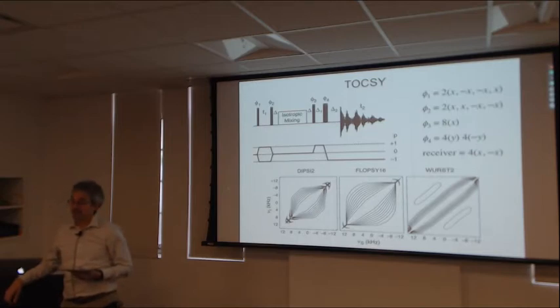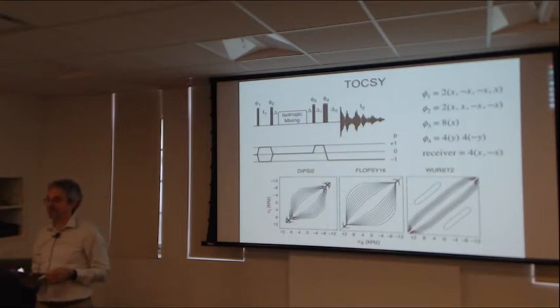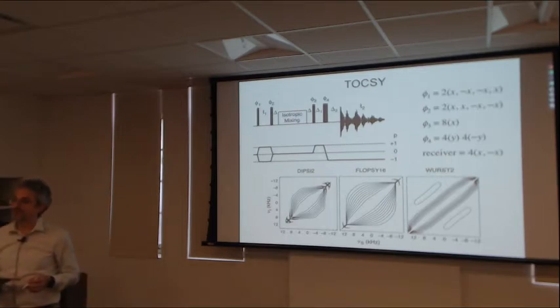Or there are methods for keeping the methyl groups protonated while the methylene groups are deuterated, and the methyl resonances are sharp because of rotation of the methyl group. So then you can relay magnetization down the side chain from the methyl groups and bring it back to the methyl groups, or migrate it on to the amide and vice versa. Quite large proteins, because you've beaten the relaxation by deuterating, and the coupling is pretty large.